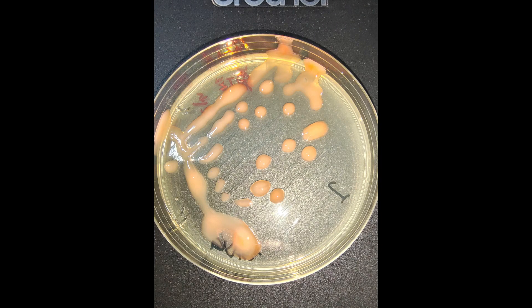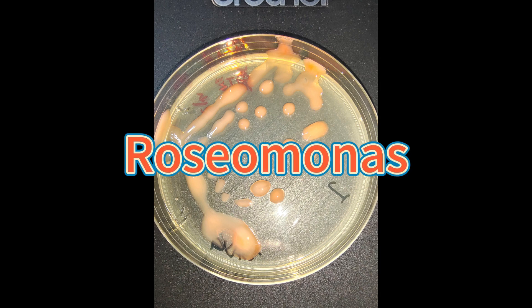The first bacteria is this slimy pinkish stuff that the AI thinks is some kind of E. coli. It's very consistent with the test results, but I think it is a bit too watery, so my answer would be Klebsiella. And the answer is Roseomonas, so no points for either.